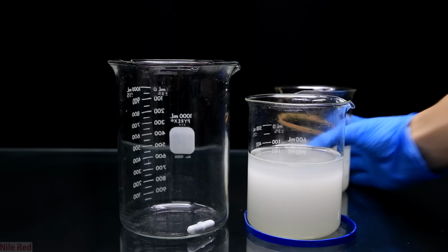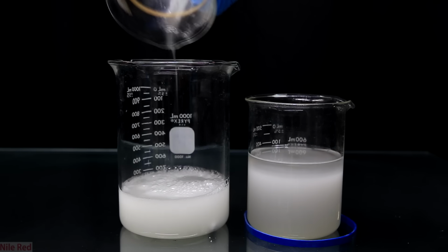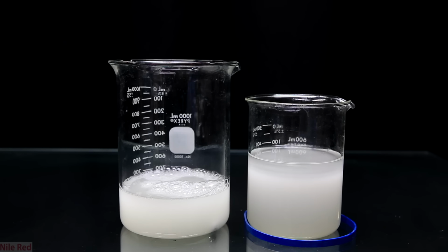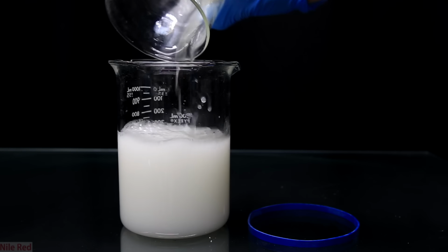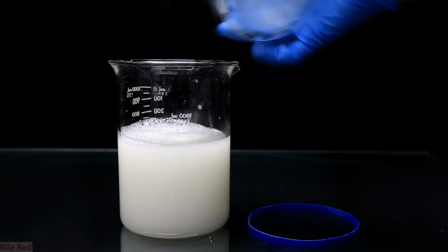In the meantime, while it was filtering, I cleaned my 1-liter beaker, and now we'll use it again and pour both of the filtered solutions in. At the bottom of the beakers, there might still be a little bit of polymer goo, and don't include this when you pour your stuff in. You might notice that the volume is a little bit higher here, and this is because of the water washings that I did.